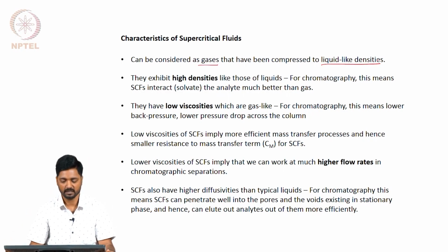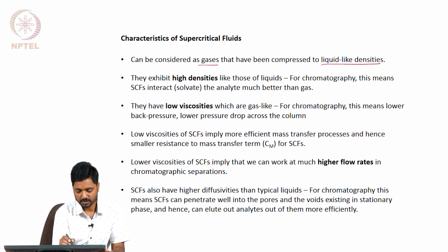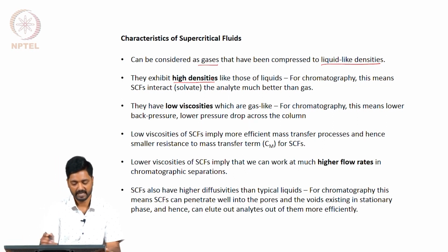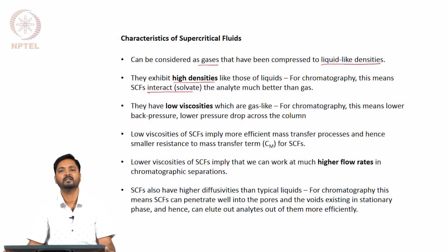We already saw that supercritical fluids have very high densities similar to that of liquids, and for chromatographic purposes this implies that the supercritical fluids can interact or solvate the analyte of our interest much better than the gas as the mobile phase. So, we can achieve enhanced solvation of our analyte when we are using supercritical fluids.